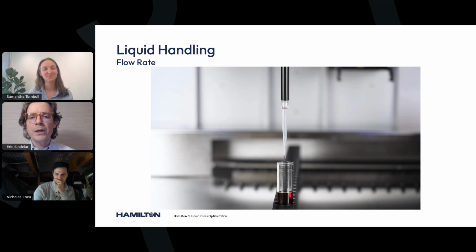What this mode is typically also characterized by, here we're dispensing above the liquid level or into an empty well, is that there's usually a volume of air called a blowout volume, also known as a trailing air gap, that helps push the liquid out of the tip and into the receiving container.